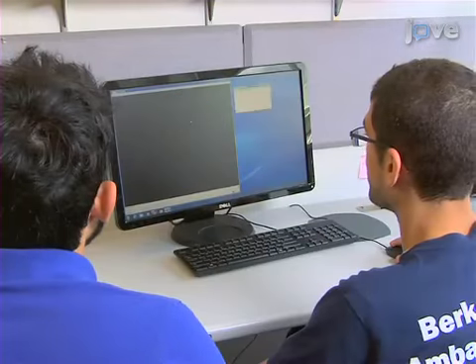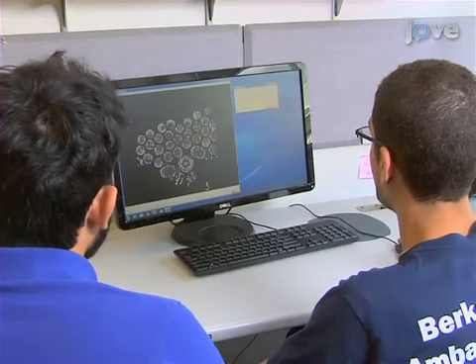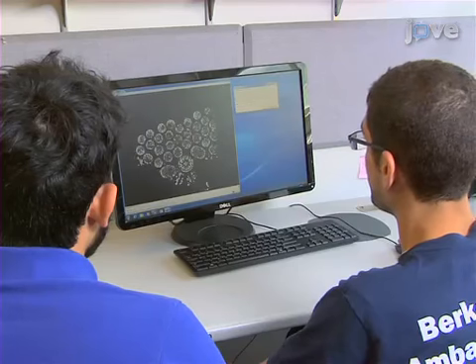Manual abstracted model generation is used when the sole objective is to create a geometrical model in order to make geometric measurements. To begin, import the data volume into a suitable program for manual abstracted model generation. Chimera software is used in this demonstration.